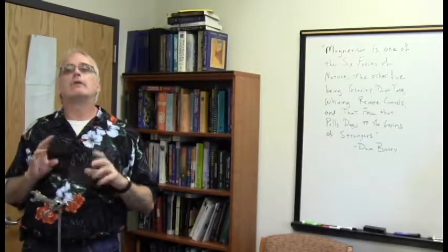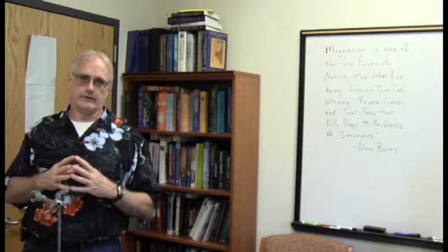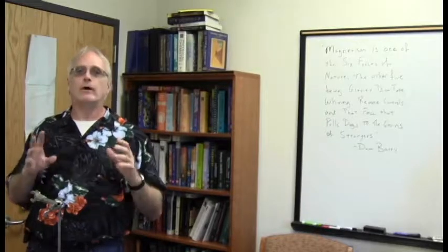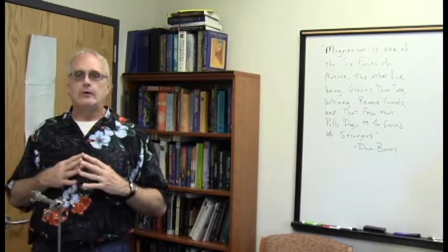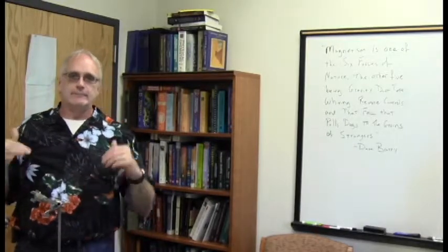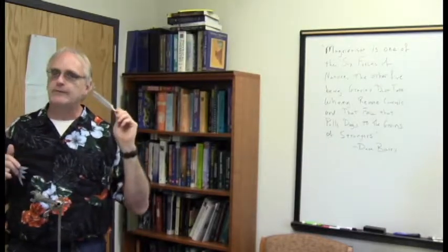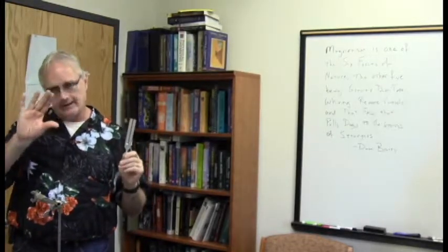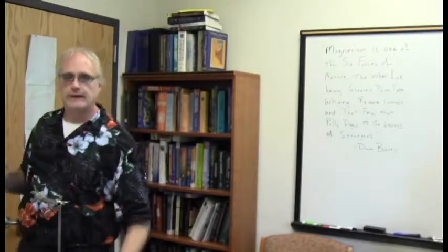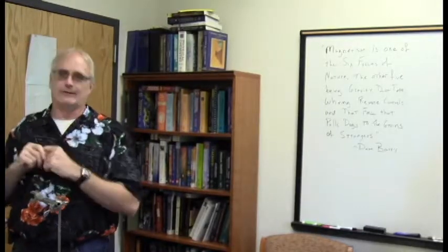And so finally, I want to show you a couple of details of how we process the NMR spectra. Because what the instrument measures is not really what you see as an NMR spectrum. What it's measuring is a collection of oscillating frequencies. Now, much like the tuning fork here, when I sound the tuning fork, I hear the sound, but over time, the sound diminishes as the tuning fork finally goes silent. I induced it to make a sound, but that sound is decaying over time.